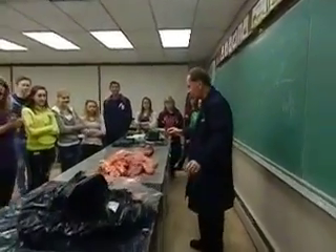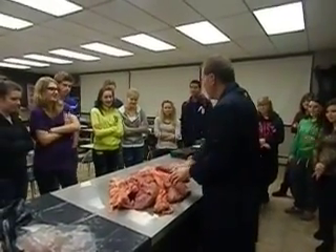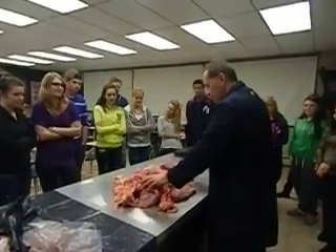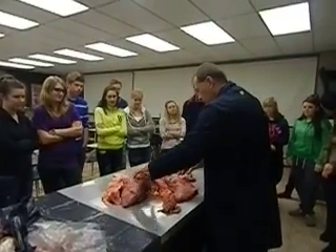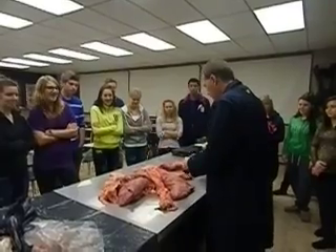Why don't you come over here and get a better view of what's actually going on? So here we go. This is from a beef cow that was taken out for us, so I can show you guys some of the things for the topics that we've been talking about.